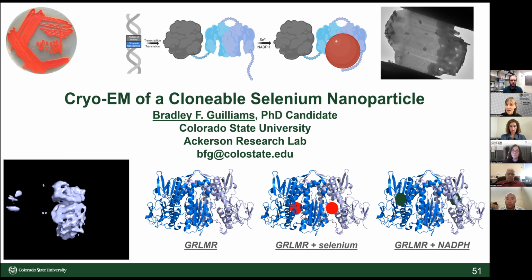Yeah, there's a question from Dimitri asking if you used an energy filter. I believe so. Yeah, all of the Cryo-EMs at NCCAT have energy filters, and they're either 10 or 20 eV slits.